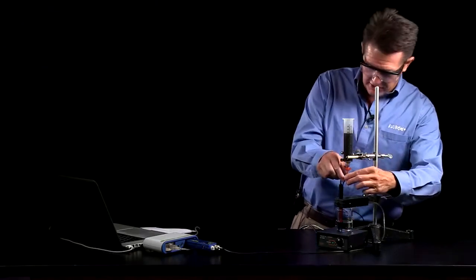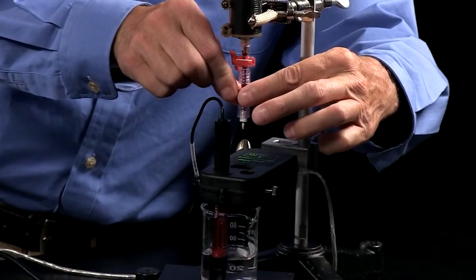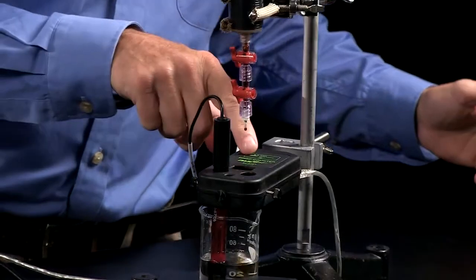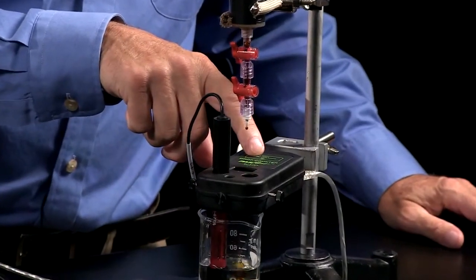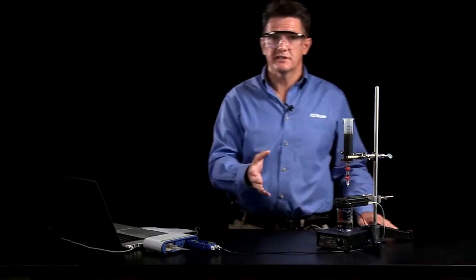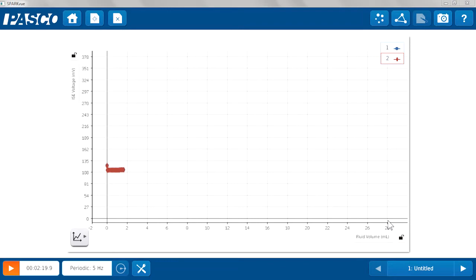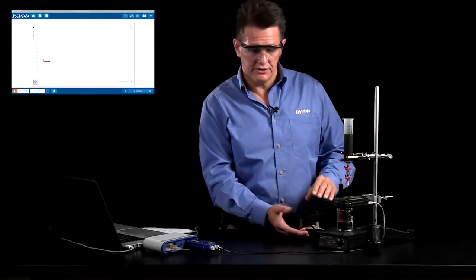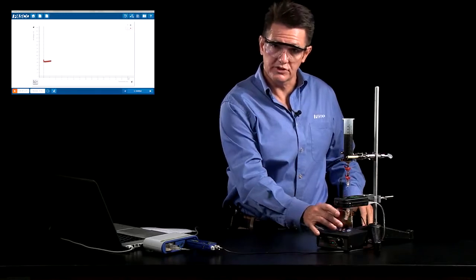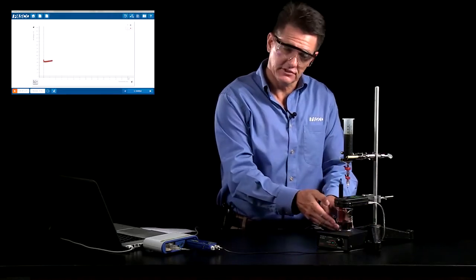I'm going to start my titration already. There I see the drops. I see the drop counter blinking on and off, which means that it is getting a reading. Once the students are done with this titration, they can determine the number of moles of vitamin C inside of this solution.